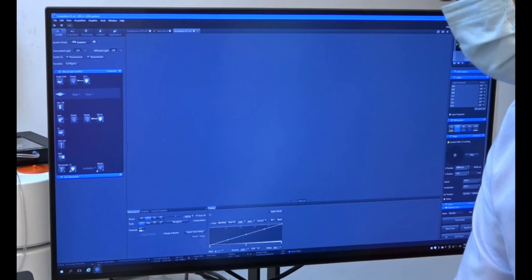based on the control unit from here. There is a shutter which controls the light. If you can see, the light now falls onto the sample through the objective, and we can see it here. So this shutter actually controls whether the light falls onto the sample or not. After this is the condenser, which is again a motorized condenser. This is the stage, and on the stage the sample is there. Below the stage, the objectives have been positioned.